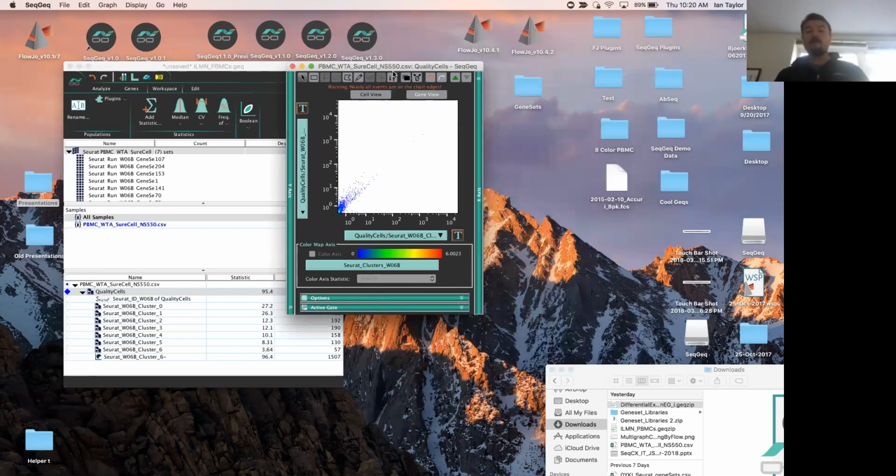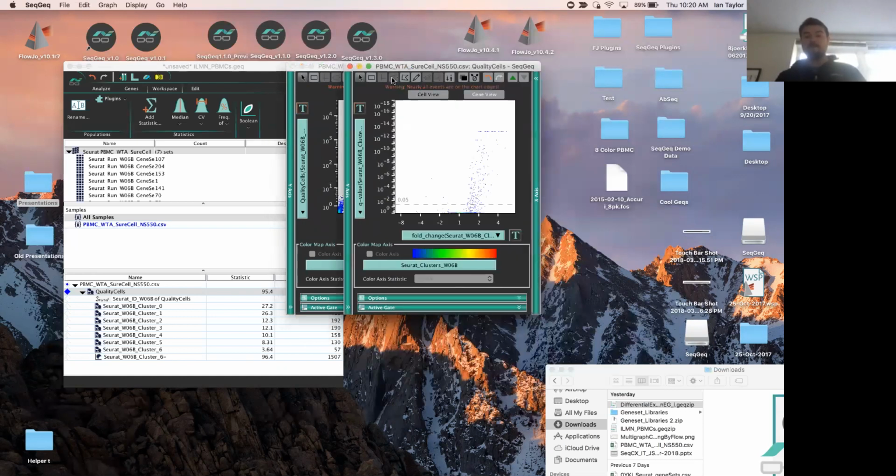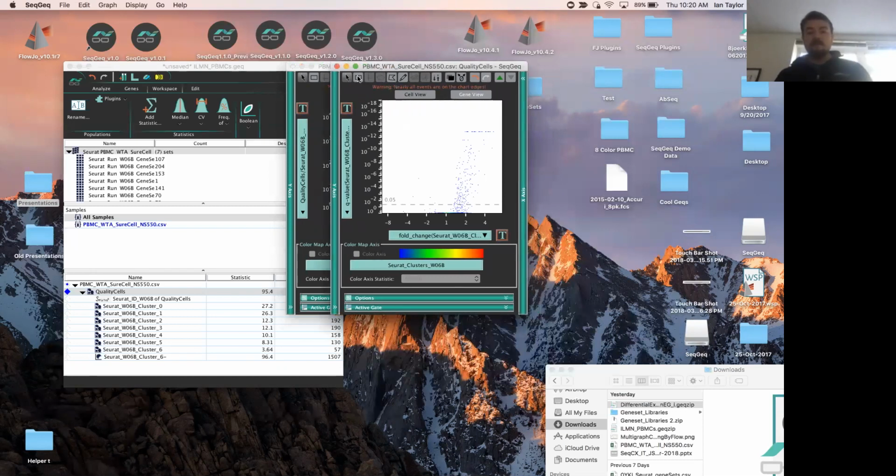And so in order to set up that statistical test, I need to open the volcano plot, which is available through this differential expression button. And there we go. This illustrates those genes, very few though they are, that are downregulated in this comparison, and a numerous amount that are upregulated in this comparison.